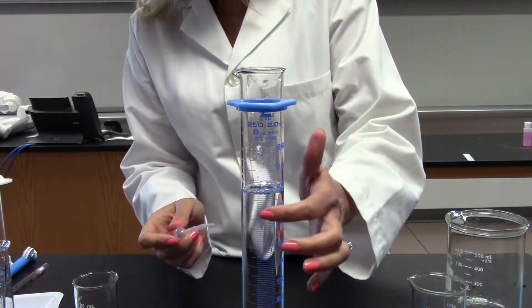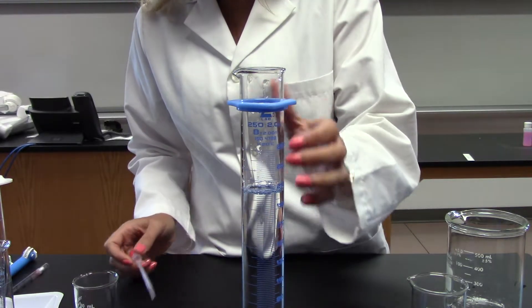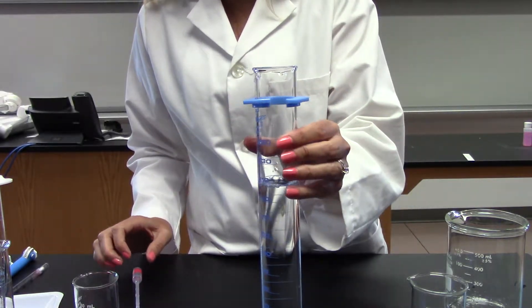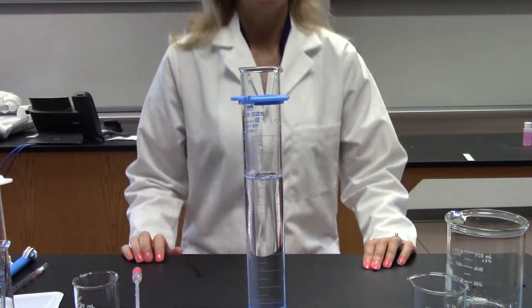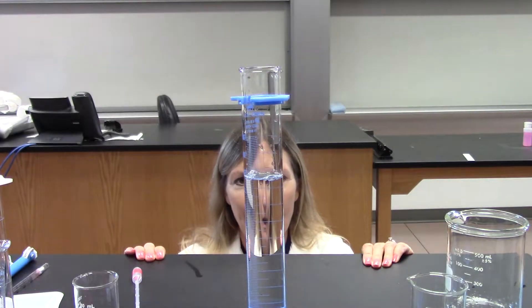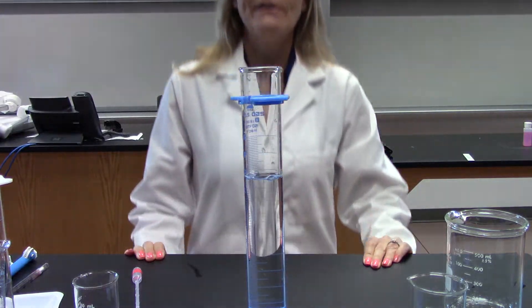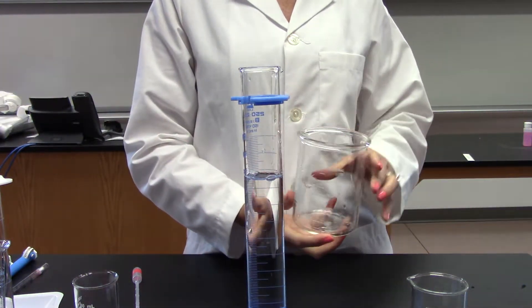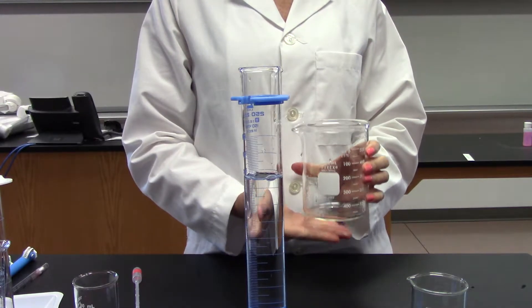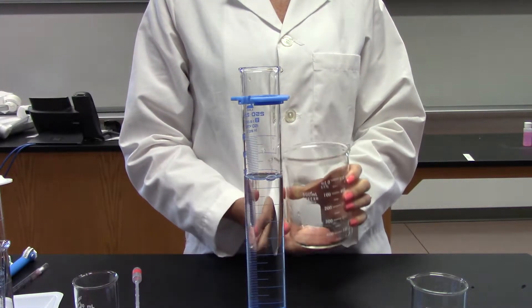But it also has more graduations. So if I look at this at eye level and look at the meniscus, which I'll explain in a minute, I'm actually at 198 milliliters. So I was off by two whole milliliters when I measured using my beaker. You would never want to use a beaker to measure liquid volume.